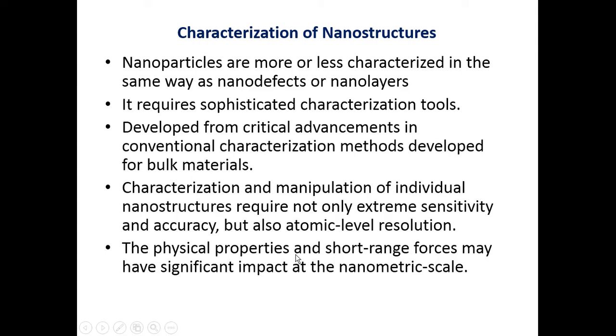In the development of nanofilms and nanoparticles on surfaces, the surface will always be developing with certain kinds of energies on layers, which we have already seen during the development of quantum dots, self-assembled techniques and all those things. So the physical properties and short range of forces may have significant impact at nanoscale.